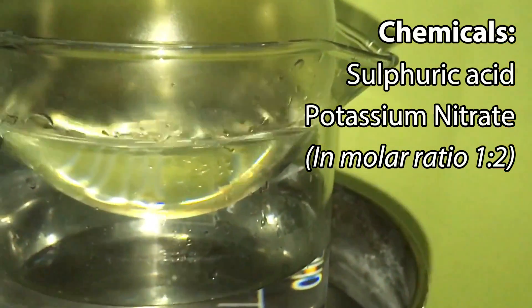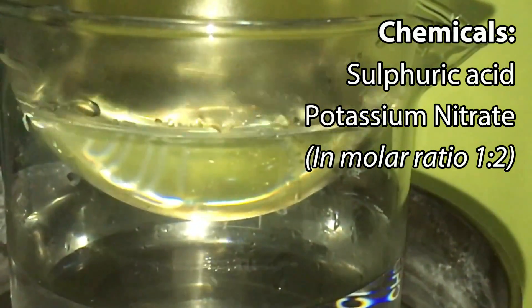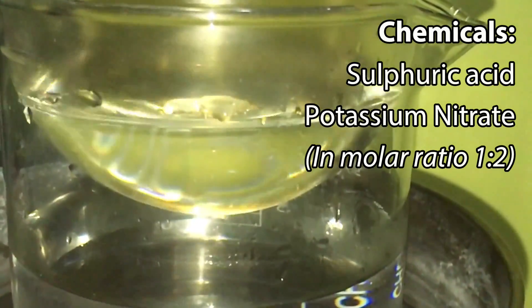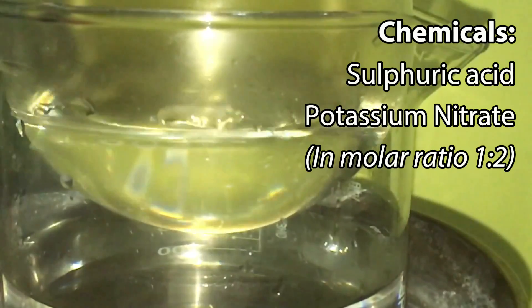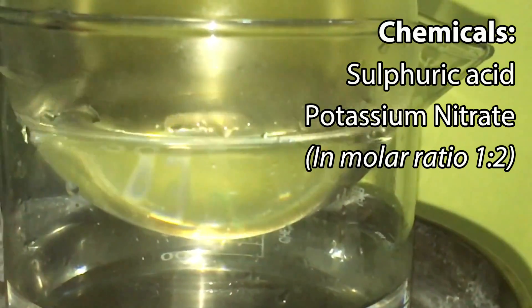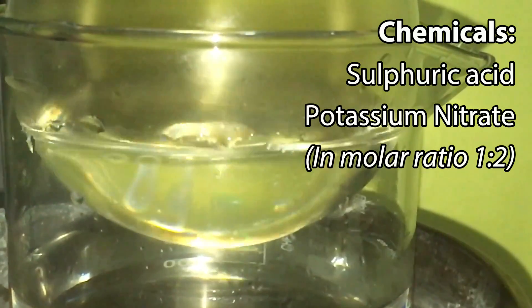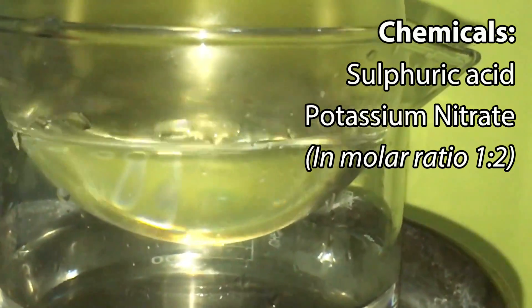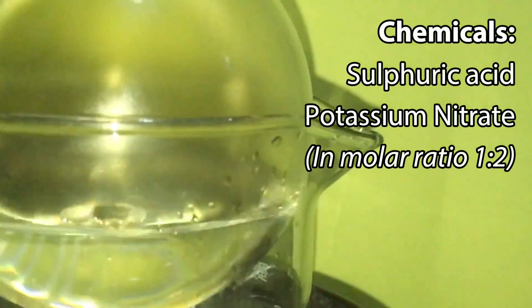So here are my ingredients: concentrated sulfuric acid and potassium nitrate. I'm using some sulfuric acid based drain cleaner so it is red and highly contaminated, but this should not affect the reaction. Basically, you can use any concentration of the sulfuric acid as long as you know the molarity of it. For every one mole of sulfuric acid, please use two moles of the nitrate.